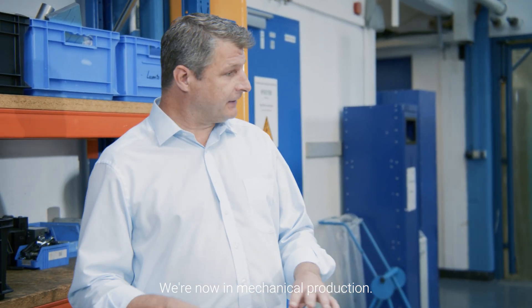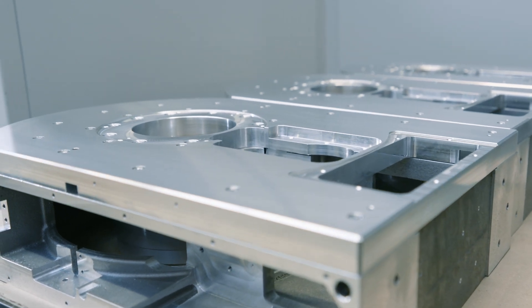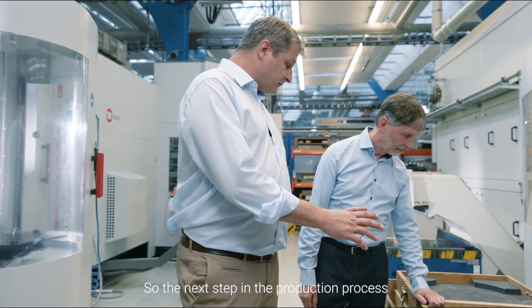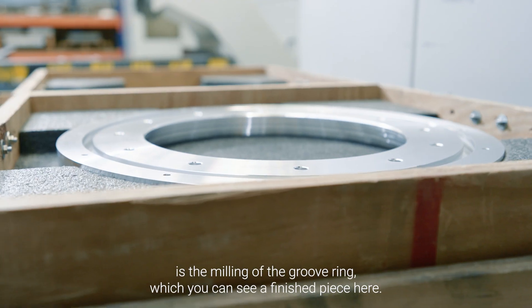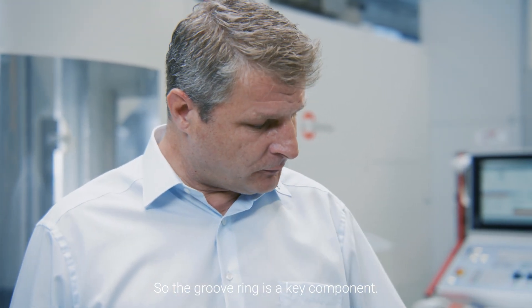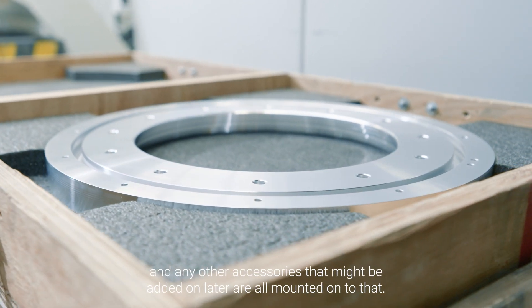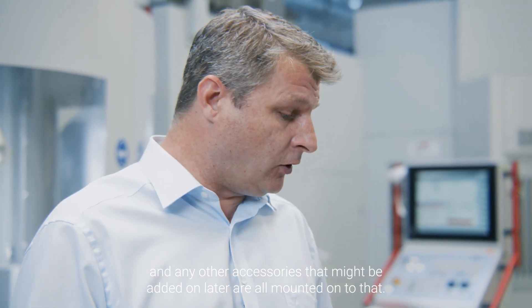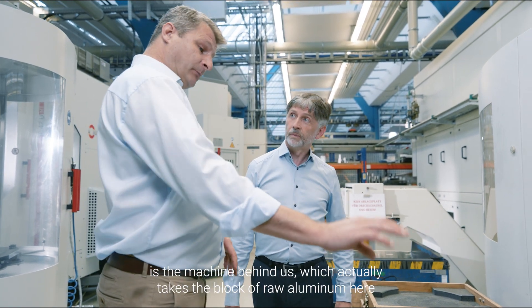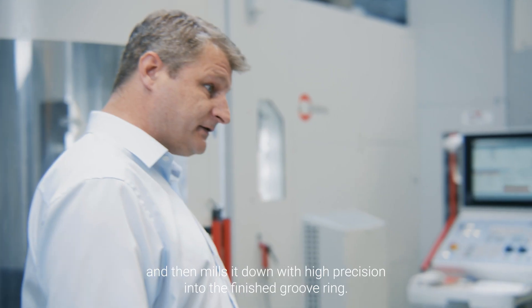We're now in mechanical production — these are the finished goniometer bases. The next step in the production process is the milling of the groove ring, which you can see a finished piece here. The groove ring is a key component; it's actually where the x-ray source, the primary beam path, and any other accessories that might be added on later are all mounted onto it. What I wanted to show you is the machine behind us, which takes the block of raw aluminium and mills it down with high precision into the finished groove ring.